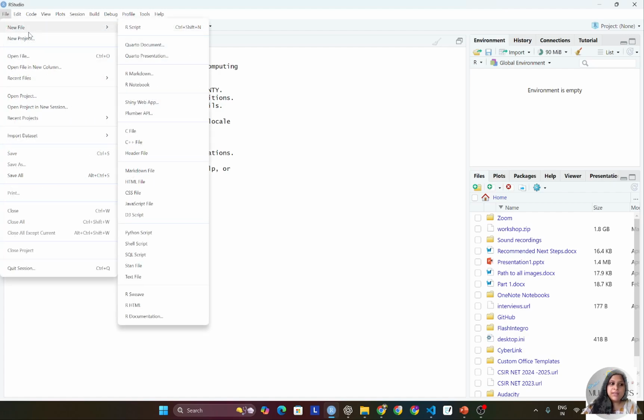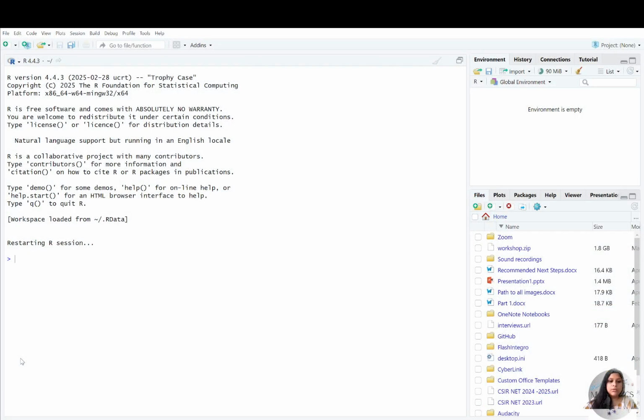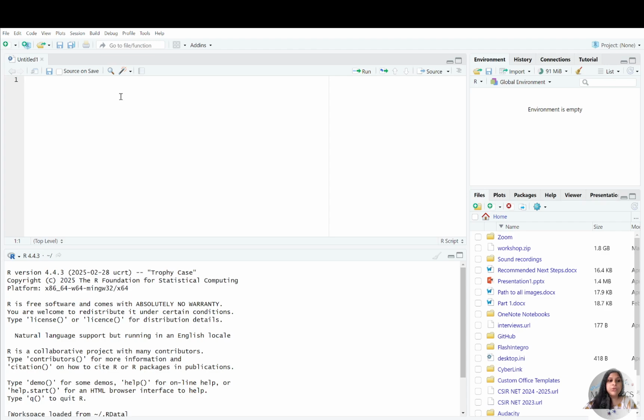So you can go to file, new file, and open a new R script, and you can just copy and paste accordingly. So first we'll be loading some libraries. This one is for data manipulation. This is Seurat, and here we'll be performing single cell analysis, and we will be needing this package for patching up different graphs and visualization, all those things.